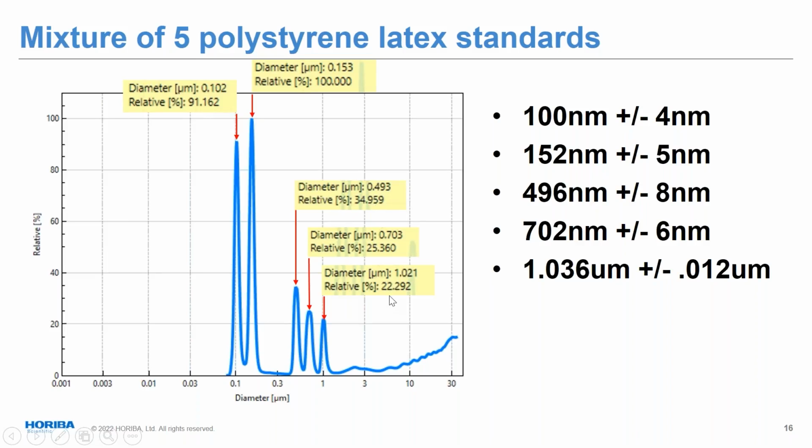22%. Again, if you had paid attention when you were mixing these together, you could now determine the actual relative amounts of each one of those 5 peaks. Because again, in mixtures of materials that are polymerized, very often you do have different sized particles that are mixed together. And so you want to know how much you got into the blend before you actually made your final product. So again, a good example of the strength of resolution of this technique.